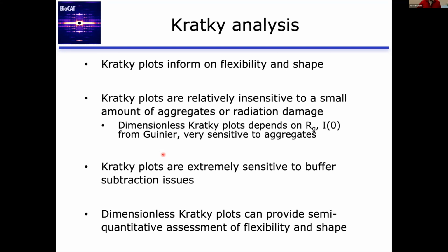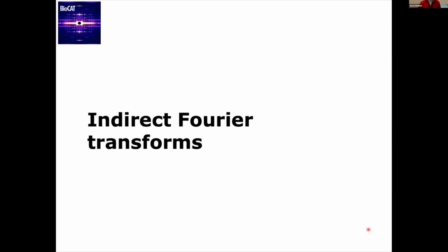It's relatively insensitive to small amounts of aggregates or radiation damage, but the dimensionless Kratky plot depends on the Rg and I0 from Guinier, so it's very sensitive to these things. Kratky plots are extremely sensitive to buffer subtraction issues, and the dimensionless Kratky plot will provide you this semi-quantitative assessment of flexibility and shape.